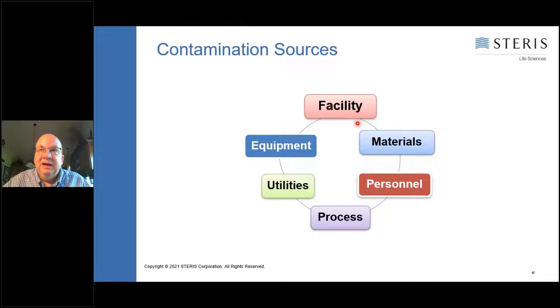Another key source, which accounts for about 15 to 20% of your bioburden contamination in the room, is materials that you bring into the clean room. So that is bags, boxes, intervention equipment, tools, and one of the biggest sources here, cell phones. All of these are potential sources of bioburden that you're bringing in the room. Just think about this, even with carts and cartwheels, when they are wheeled into a room, those wheels are in contact with the floor and you could be spreading spores, fungal or bacterial, into the controlled space.